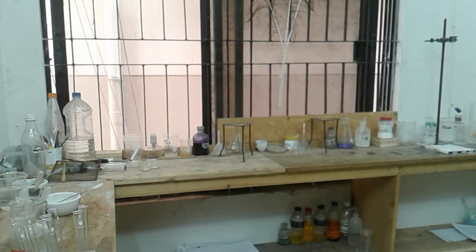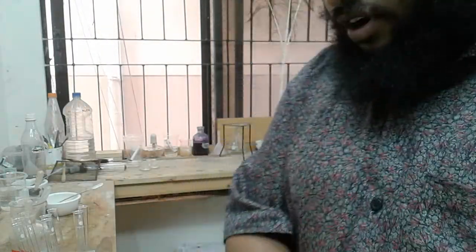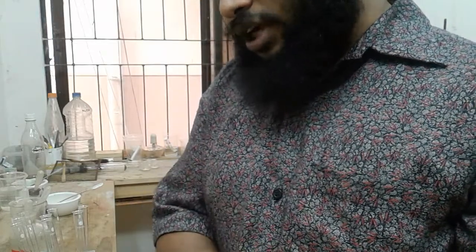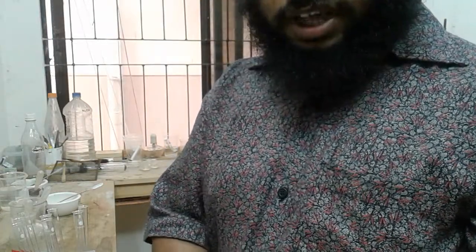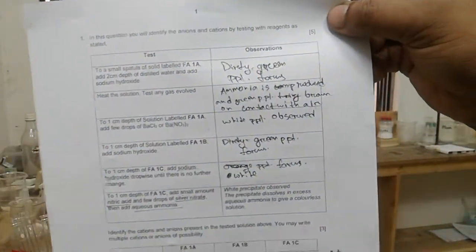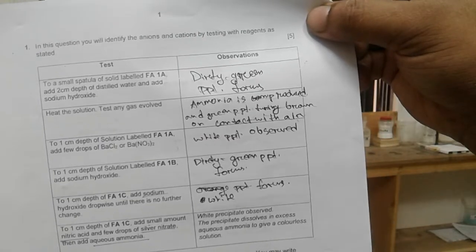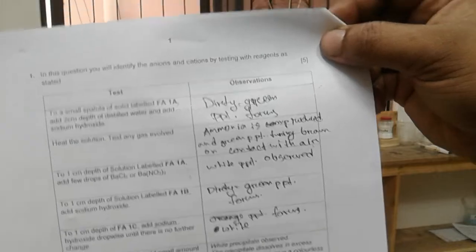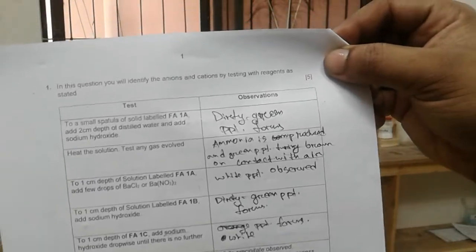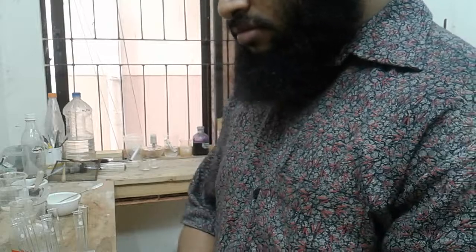Okay. So I have cleaned the test tube 10 times. In our first experiment, it will be a dirty green precipitate which is insoluble in excess, which the candidate has not written here, so his marks will be penalized. And later on he has heated the solution and ammonia gas was evolved. Okay, the smell was not bad, but it's too bad.